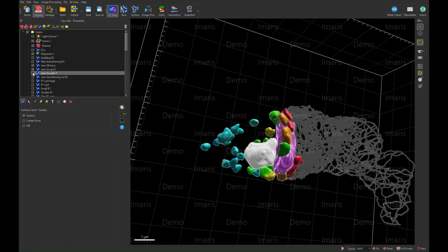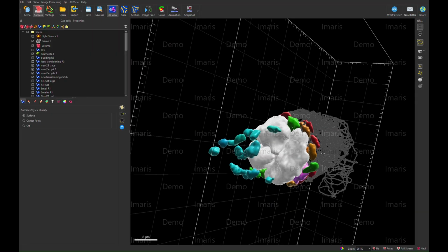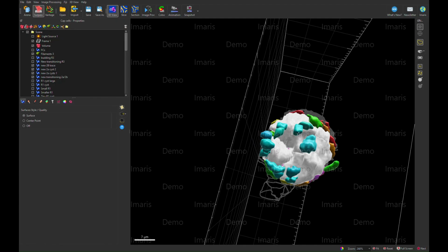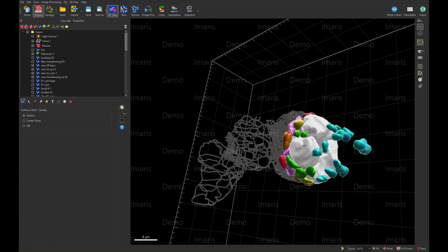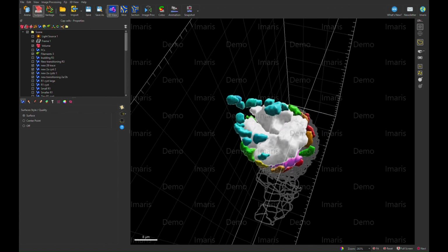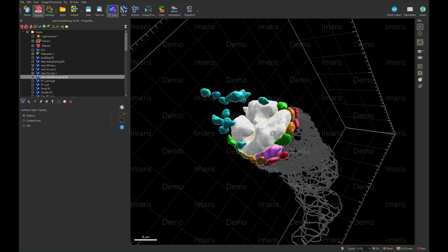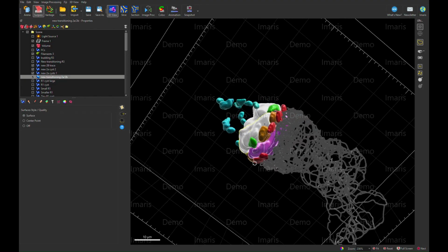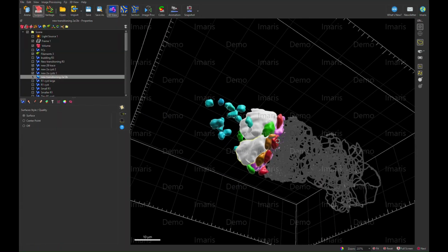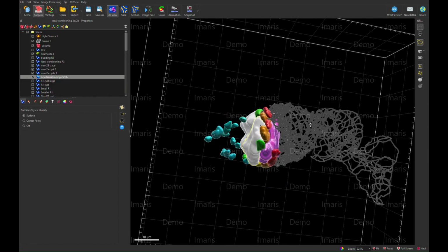Then looking anterior, we can see these 2A cysts here as well. There's 3 of them outlined here. The 2 on the left are much rounder and smaller. These are typical 2A cysts. But on the right here, we have one that's starting to flatten out. It's only taking up half of the width of the germarium, but seeing that it has started to flatten out, we can tell that it is going to be transitioning and probably taking the place of this 2B cyst once it matures and leaves the germarium. Well, starts to leave the germarium.